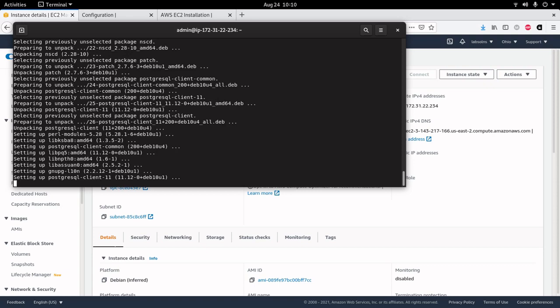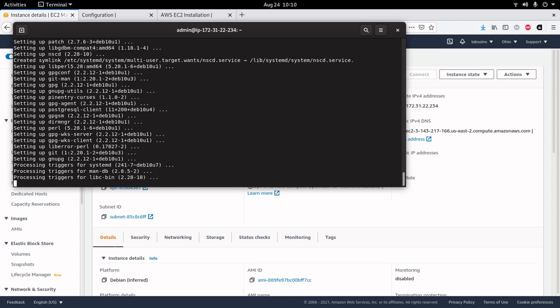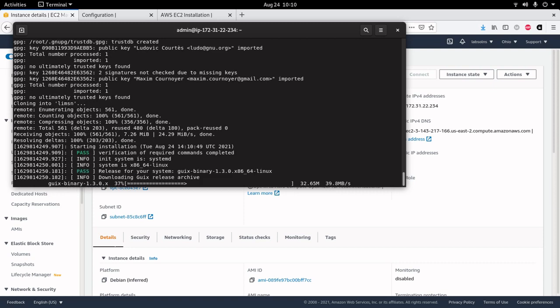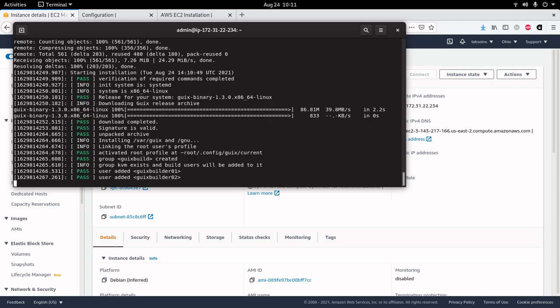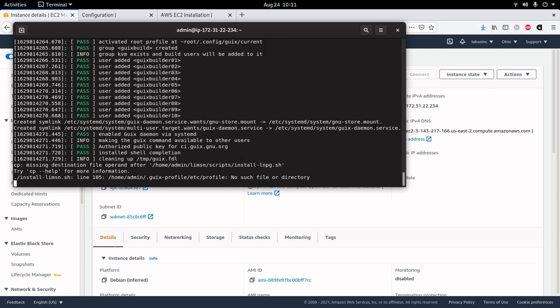Note that the IP address and number of plates per plate set will be used to modify the configuration file. You can go to labsolutions.com and click the configurations hyperlink and find the available configuration options that can be modified that will affect how LIMS Nucleus runs. If you have a static IP address, this is where you would have entered it, and your EC2 instance would have to be configured to make use of that static address.